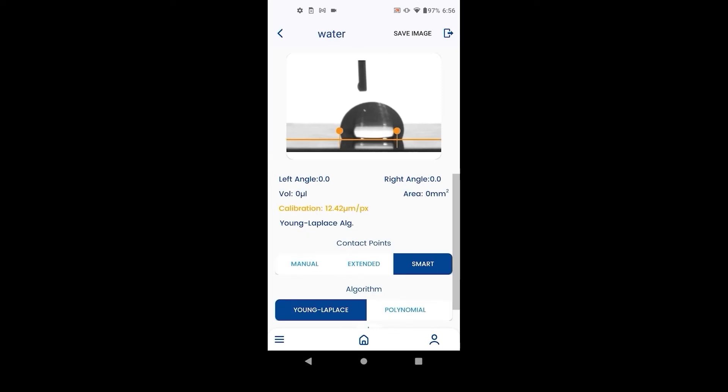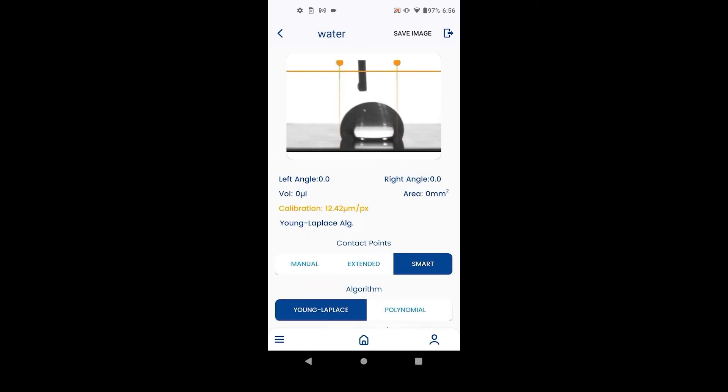The Young-Laplace method is the recommended method for axisymmetric drops. It will average out the difference between left and right contact angles. Unlike the polynomial method, the needle has to be outside the droplet, and we need to complete the calibration process to use this method.